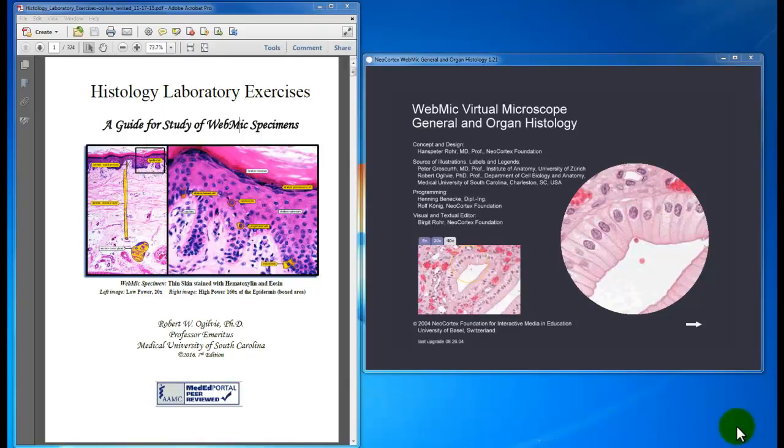This is a video demonstrating how you will use the required lab manual for the course, Histology, Laboratory Exercises, a guide for the study of WebMic specimens with the WebMic program that you access over the internet with links that are provided on the course website.